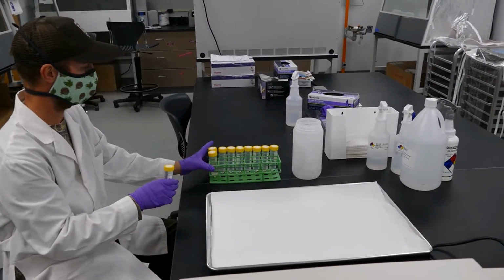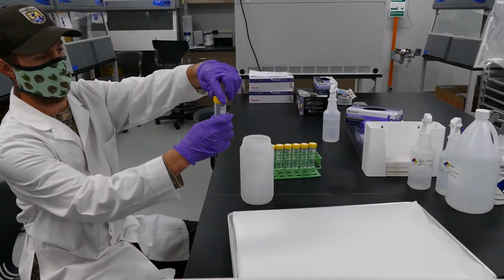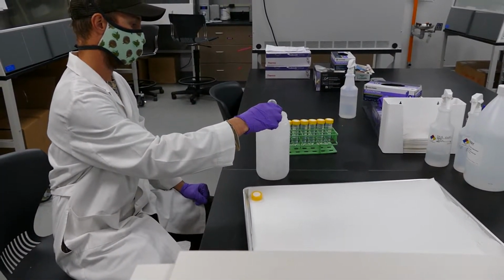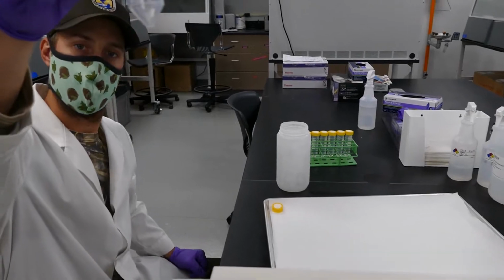Remove caps and carefully decant each tube to ensure the pellet remains at the bottom of each tube. Placing the tubes back into the tube rack and placing the caps in numerical order of removal on the clean tray. Absorbent matting is used on the trays to keep spills to a minimum and also helps keep the caps from sliding around on the metal tray.